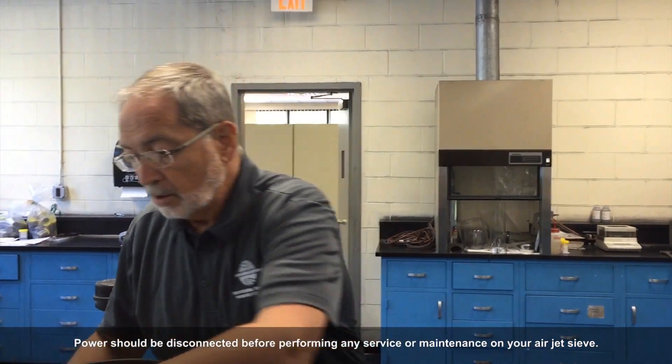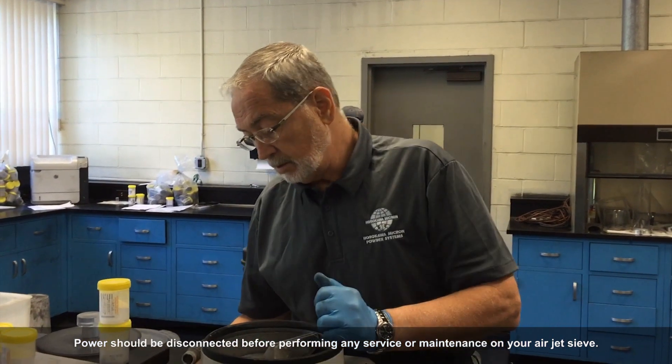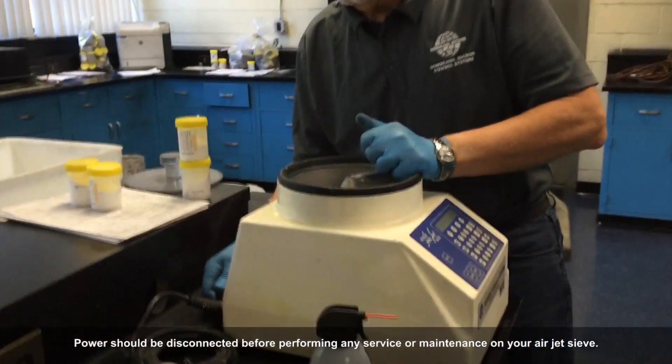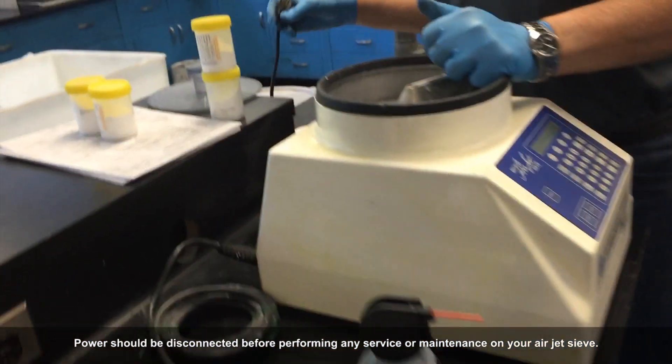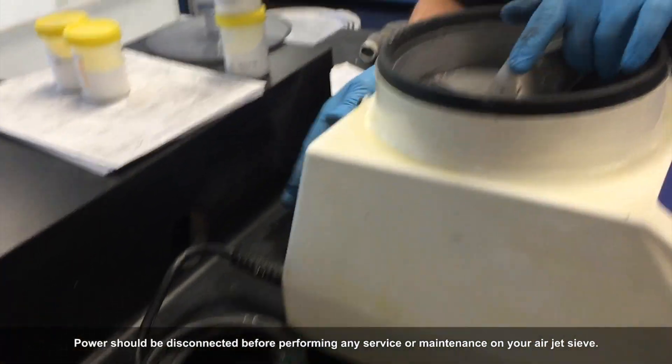First and foremost, we're going to make certain that the power has been removed from the device. Secondly, we're going to take and remove any additional apparatus that may be connected to the device, such as your vacuum and your vacuum hose.